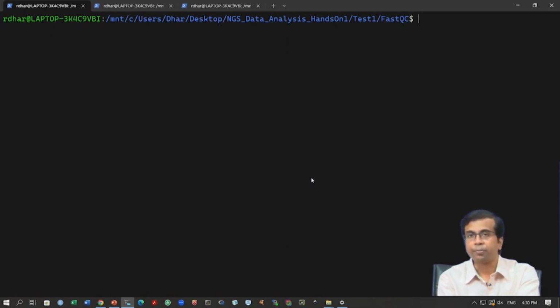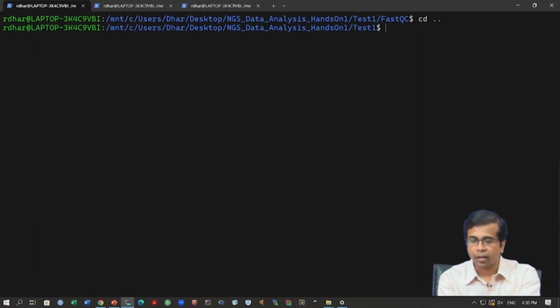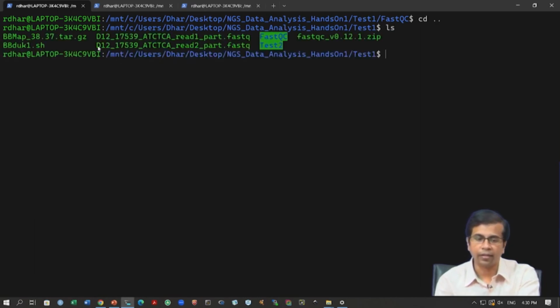So, how do you call this program first? QC inside this folder. To run that I will just come out, because our data files are here in this folder, right. We need to give these data files to that program. I will now call this program, which is inside this folder, so I will have to go inside that folder to call it. You notice I have given this dot slash, which means we are executing this program. This is how we will call this program.